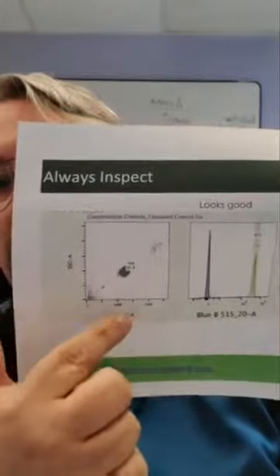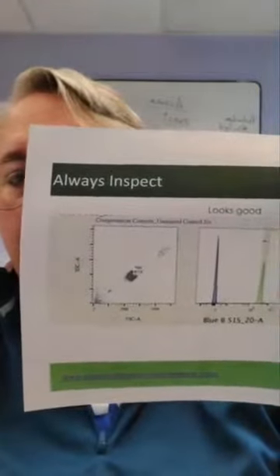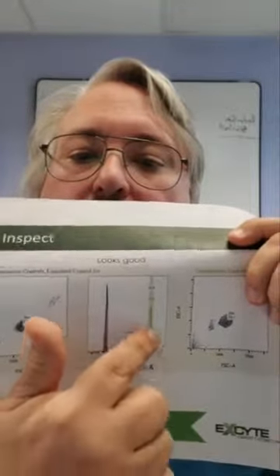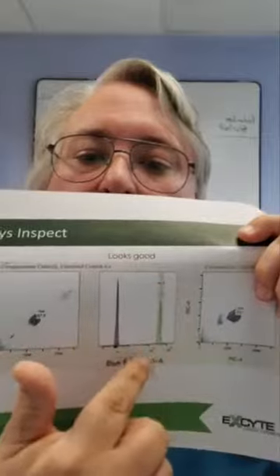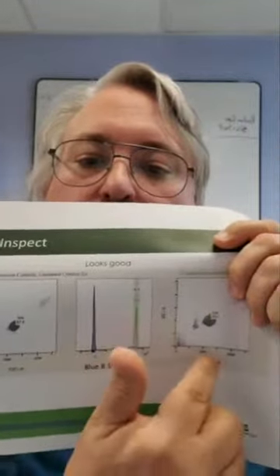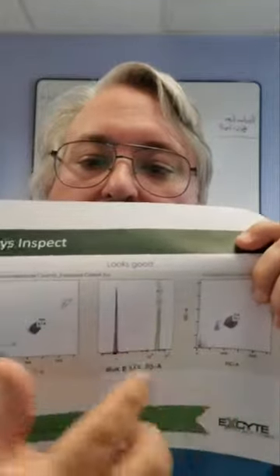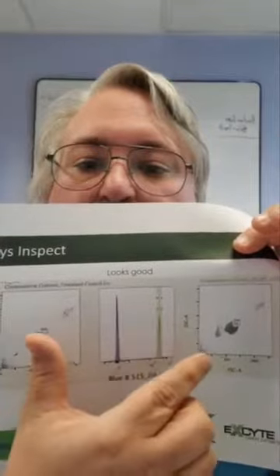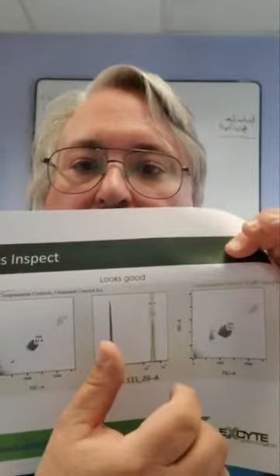Now it runs an automatic compensation algorithm, and here I have some beads looking at that compensation window. Here we have a forward scatter, side scatter plot showing where the beads were identified. In the middle plot we can see the histogram showing the positive and the negative sample. And on the far right we have another plot showing the forward scatter, side scatter, the gating for the beads. In this experiment, we had positive and negative in the same tube, so the software used the same data for both cases.